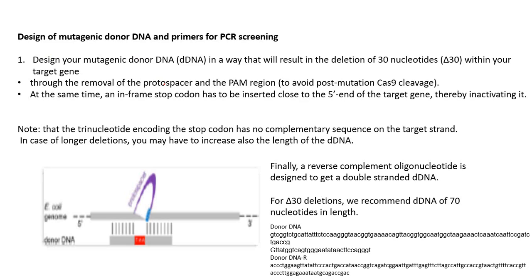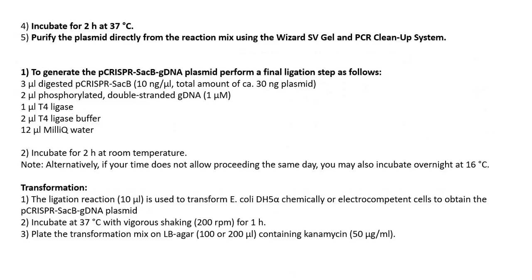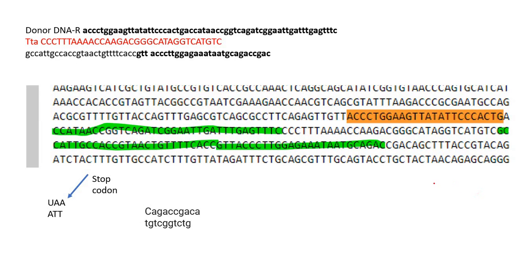Okay. So now what you can do here, I will go with the example. You can see this is the sequence we have already designed: triple C, triple T, 4A. Triple C is your PAM site. This is triple T and the 4A. Triple T, 4A, double C. So here you can also see it is triple T, 4A, double C. So this is the sequence.